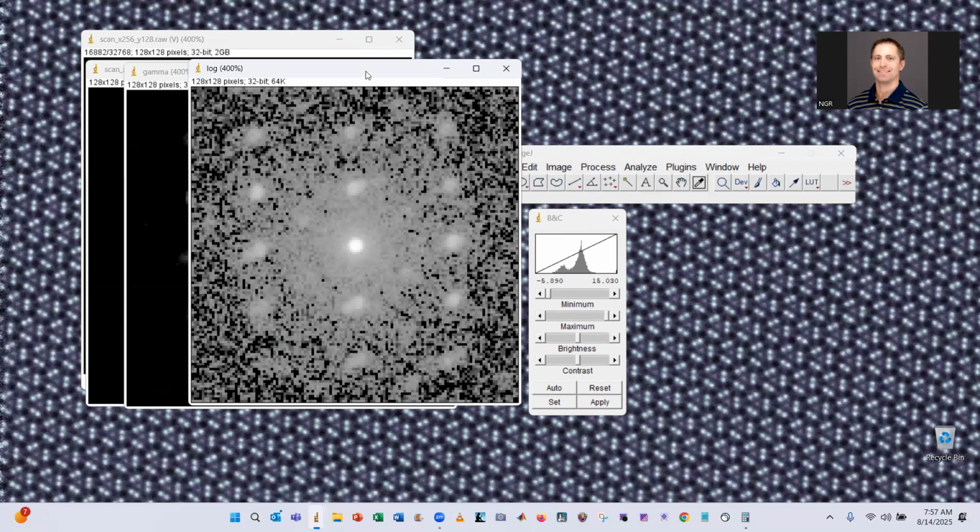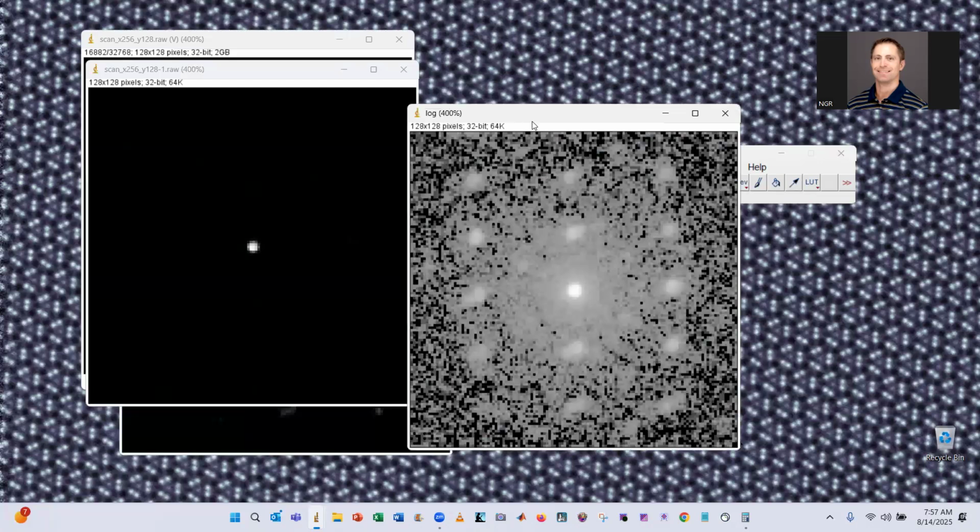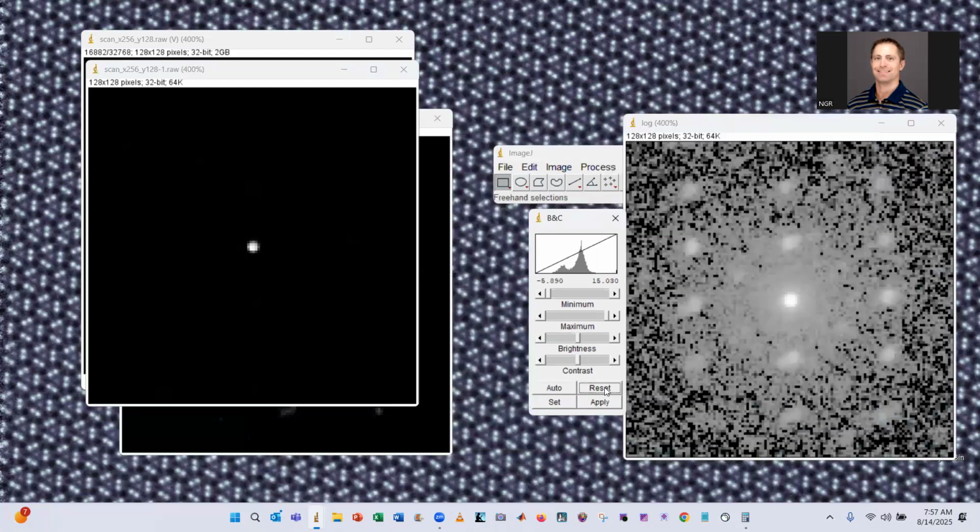I think actually with this, if I go back here to the original data, it's claiming there were negative values here. So that's interesting. I don't know what it did. I think it might have truncated or brought these up because you're obviously not supposed to be able to take a log of a negative value.